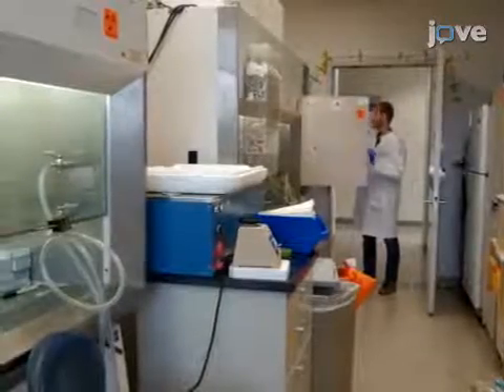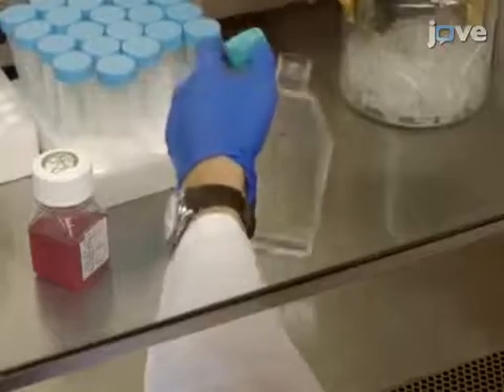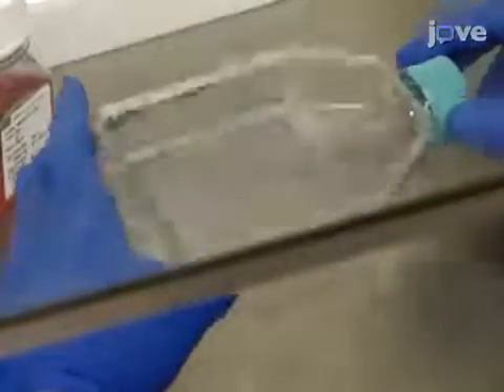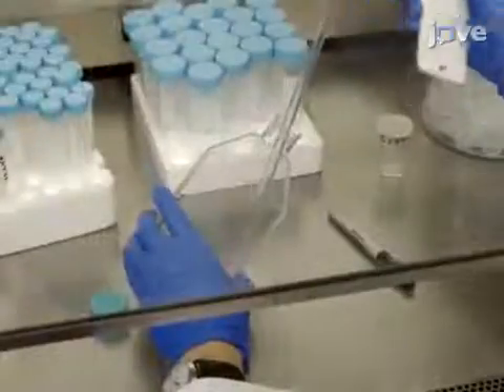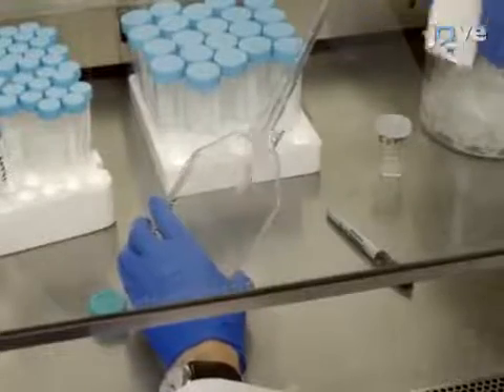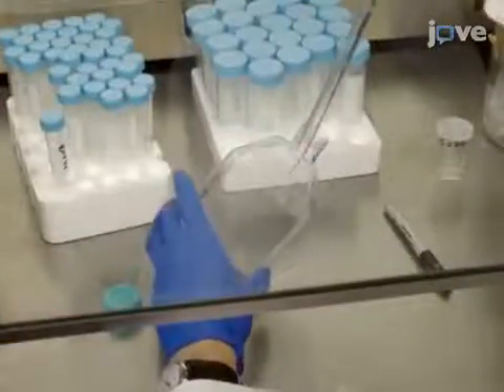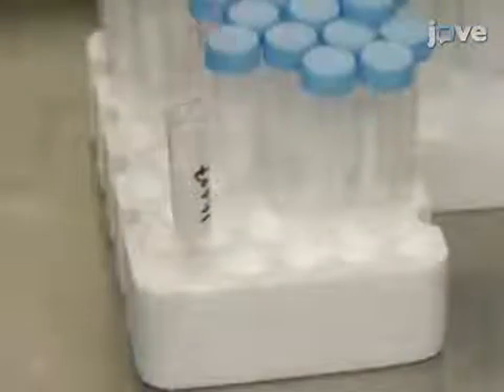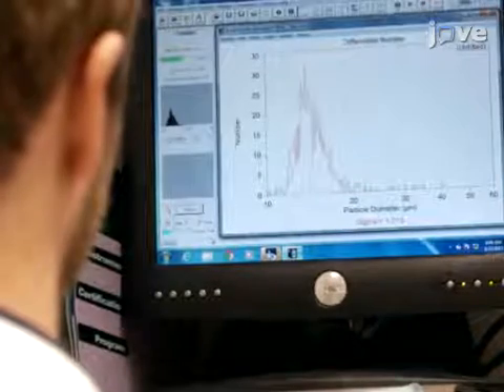To begin, remove a culture dish containing adherent cancer cells from the incubator. Wash the cells once with PBS and add 1.5 milliliters of 0.05% trypsin EDTA. Then incubate the cells for 3 minutes at 37 degrees Celsius. Once the cells have detached, pass the trypsinized cells through a 5 milliliter pipette to generate a single cell suspension, then add 8.5 milliliters of cell culture media to the flask. Count the cell suspension using a cell counter.